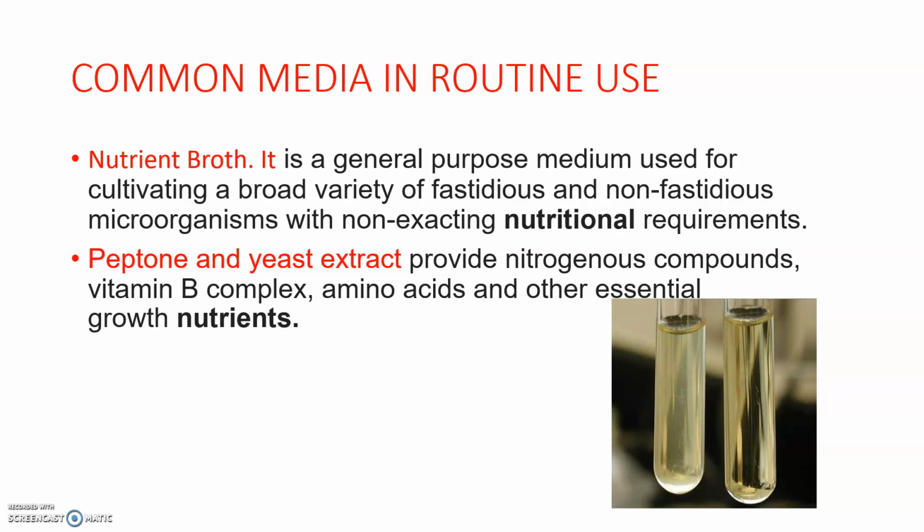Non-fastidious means they don't require any special needs, special nutrients. They are called non-fastidious microorganisms. So this nutrient broth is common to both fastidious as well as non-fastidious microorganisms with non-exacting nutritional requirements.